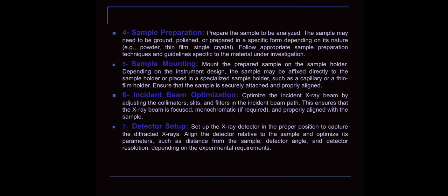Sixth one, incident beam optimization. Optimize the incident X-ray beam by adjusting the collimators, slits, and filters in the incident beam path. This ensures that the X-ray beam is focused, monochromatic, and properly aligned with the sample.